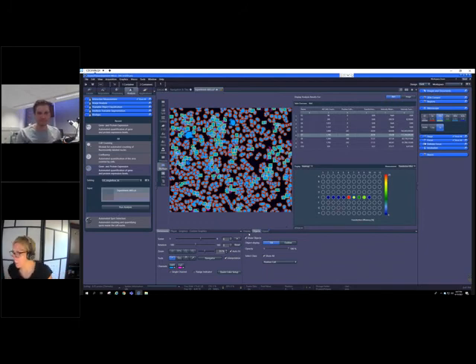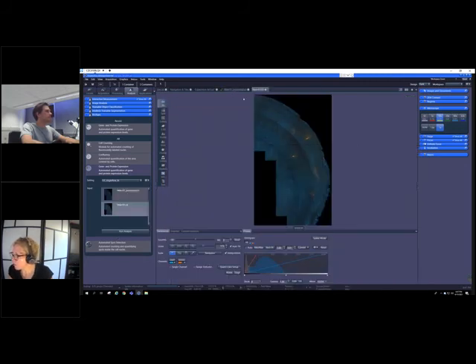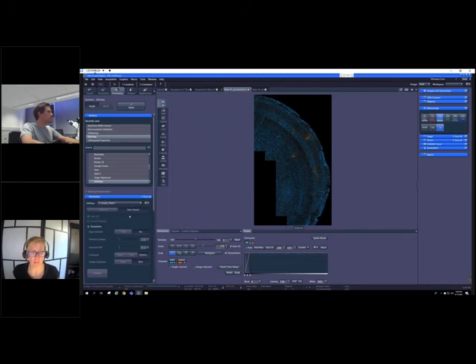Okay, so there's a question here about the deblurring processing you showed. I don't know if it would be possible to bring that image back up or not. I saw that you had closed it. Mm-hmm. So while you're doing that, I'll go ahead and ask the question, which is, I'm curious to learn more about the deblurring processing you showed. Can you tell me more how this is processed or calculated? Yeah, sure.